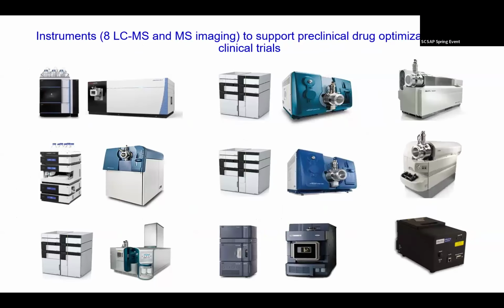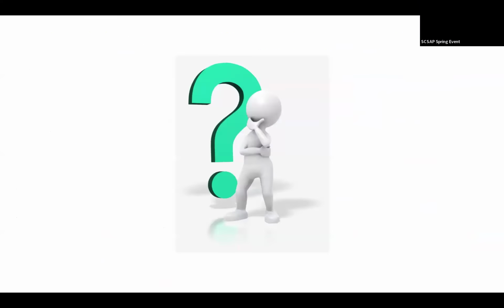So we try to help on that, and that's the equipment. We are very well equipped. We have 8 LC-MS and imaging capability. Let's finish. I stop here, and we have 5 minutes for questions. Thank you.